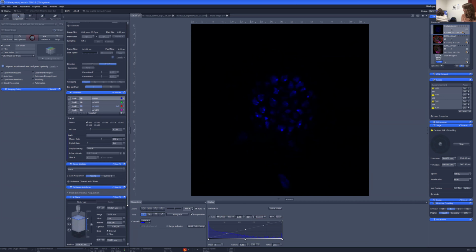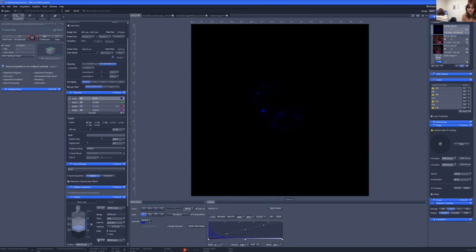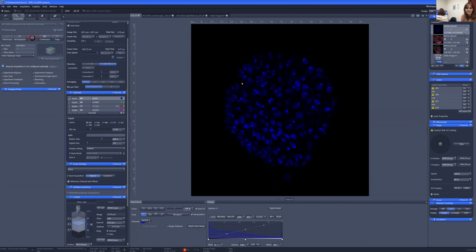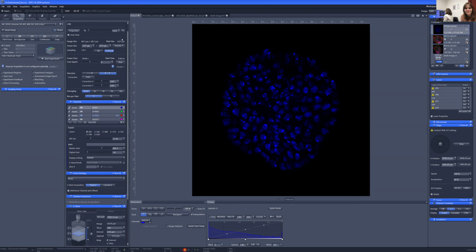So actually, Mikala, would you mind telling us what you're working on right now? So the very first thing that I did was zoom in on the sample so that I'm really only imaging the bounds of the organ more closely. This is the entire outline of the organ, but all of this black space is where the sample isn't, and I'm not interested in that.